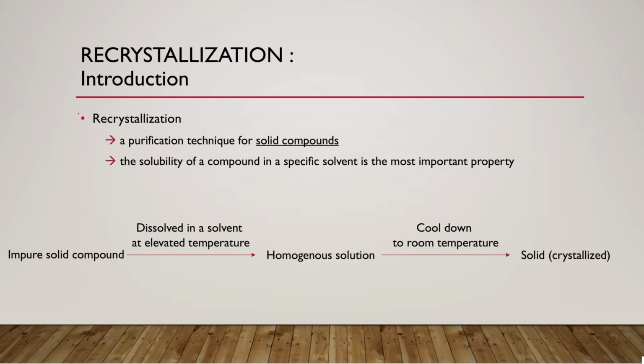So basically recrystallization is a very common and conventional organic chemistry technique. I mean, just a purification technique for solid compounds. In organic chemistry, we always have solid compounds and liquid compounds, those two physical states of molecules.